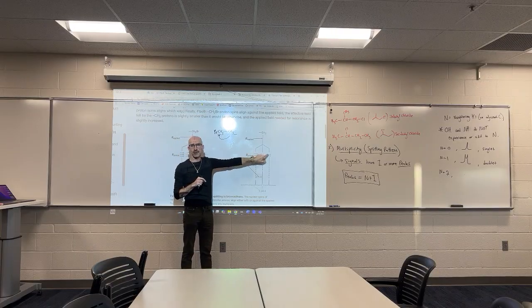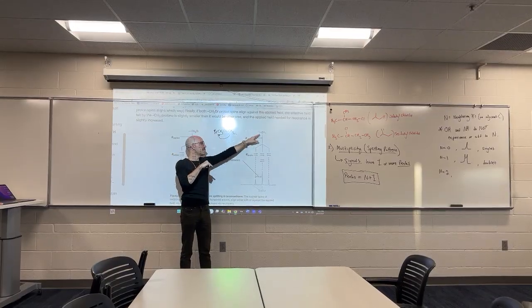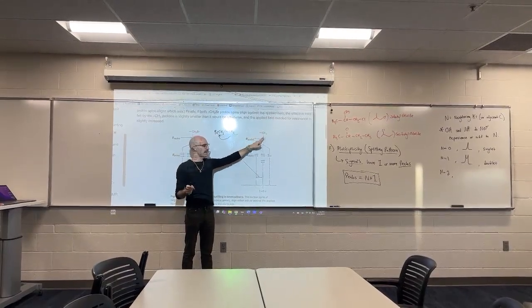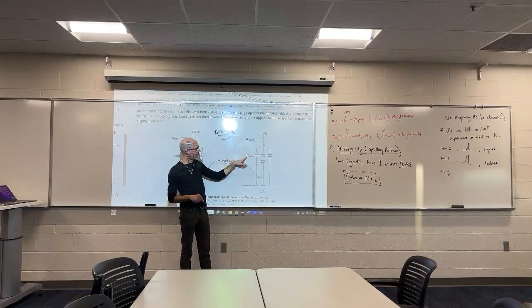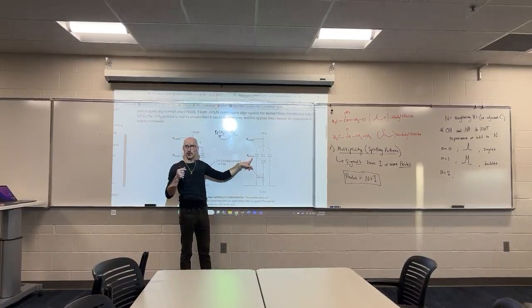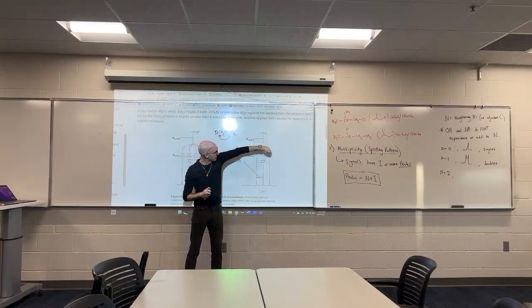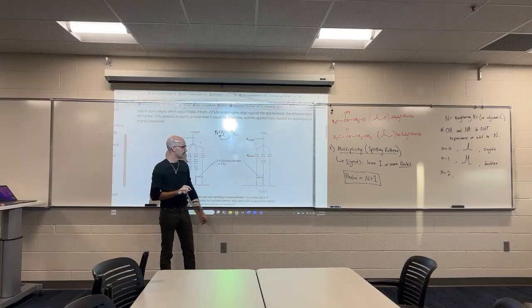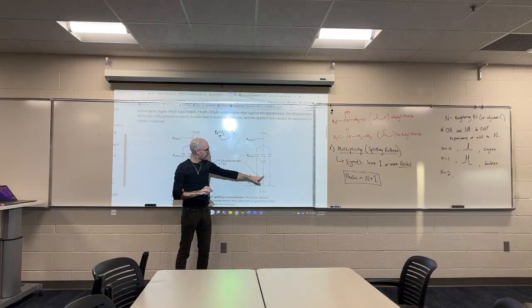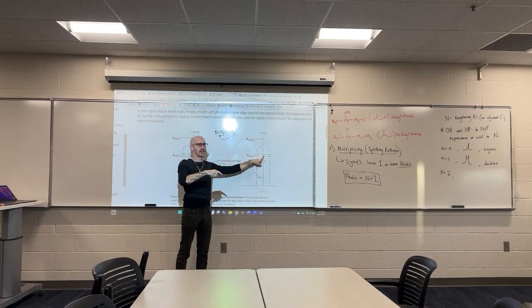And these 3 different alignments of the neighboring hydrogens impact how these 3 hydrogens experience the magnetic field. You'll see here that the magnetic field is applied, and now we're looking at the magnetic field of the protons, because spinning charged particles create magnetic fields of their own. And if those magnetic fields are aligned opposed the other way, then we get a greater chance of the neighboring hydrogens. This is so weird. The neighbors dictate the shape of your signal.